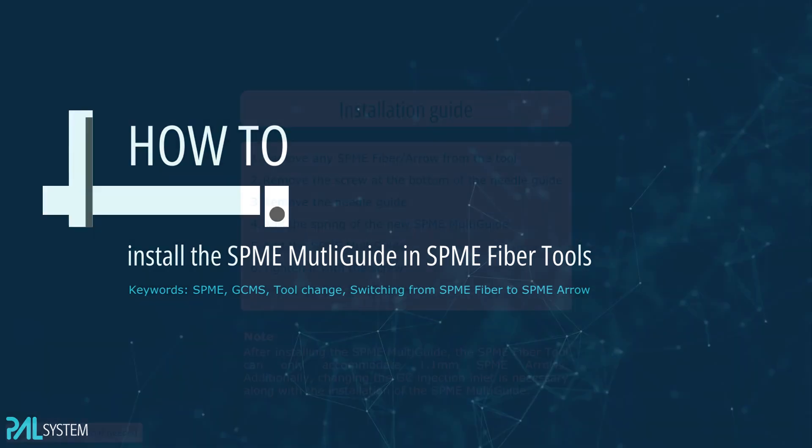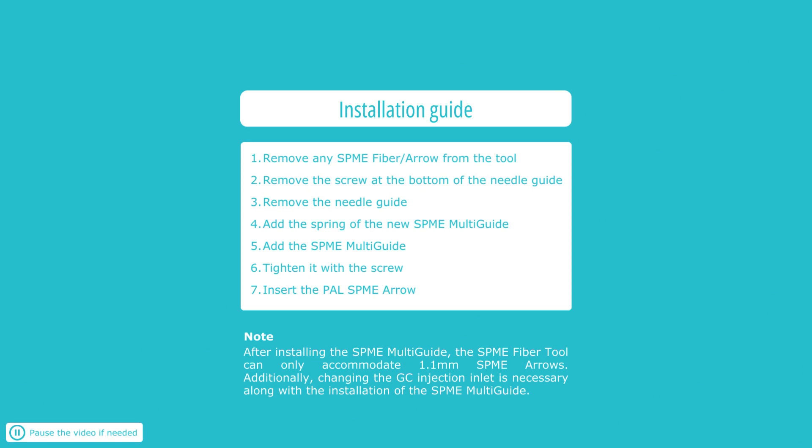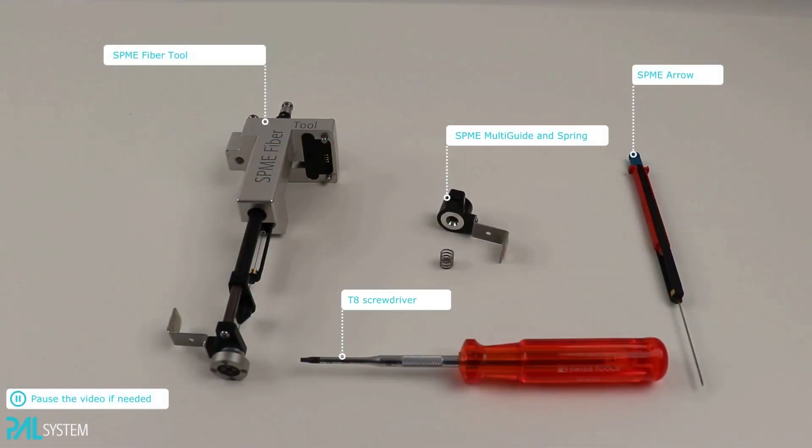In today's how-to video, we will show the installation of the new SPME Multi-Guide. To do so, we need the following materials. Please pause the video at any time if you need to.